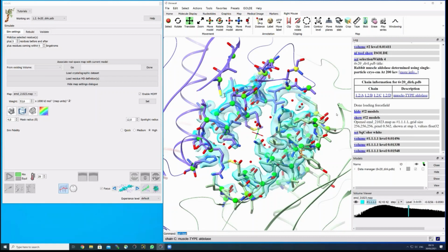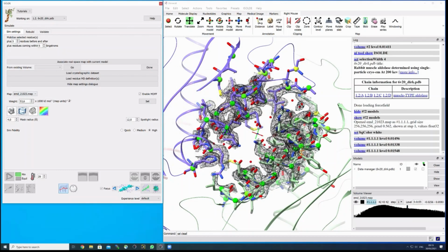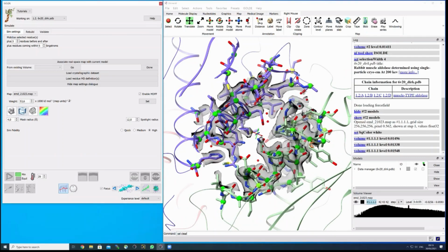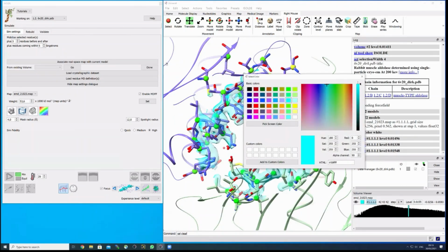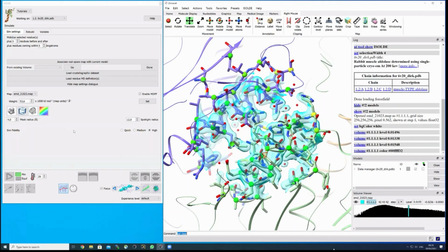Then let's go into Isolde a little bit and start there first. So this is the starting window essentially. Here we can change the appearance of the map. We can change the color, whatever we like. We can have some weird surface view, which is not so useful. Now it's in black. You can change it back to the standard blue. So these are standard functionalities here. What we have down here is the so-called spotlight radius.